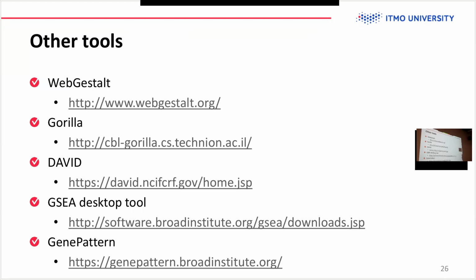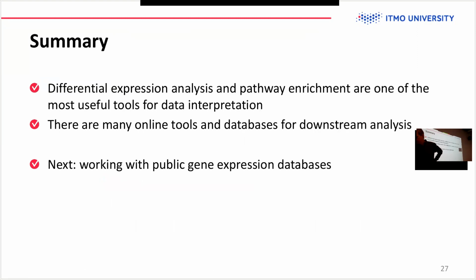And actually, here you can put your background genes, your gene universe, so the hypergeometric test is done correctly. There is other software, but I don't really like any other things. But WebGestalt you can try to use.